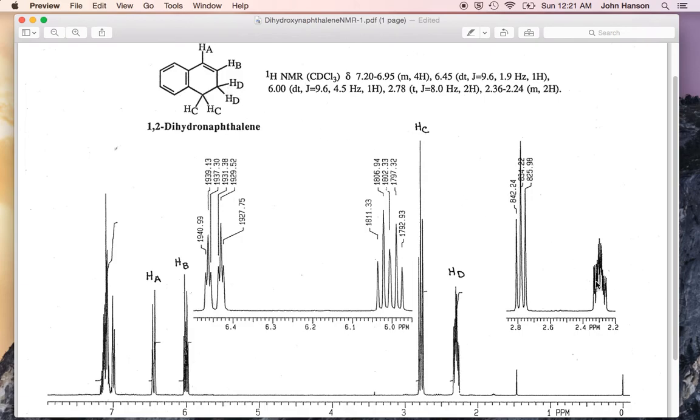But then when we see it's more complicated, we say, oh, there must be something else going on. Oh, it's that long-range coupling, and we already knew that because we did HA first, and we saw there was a long-range coupling from A to D, so that means there must be a mutual coupling back the other way between D and A. So we know that there's that, and we actually know what the magnitude of it is. It's exactly what we found in HA of 1.9 hertz.